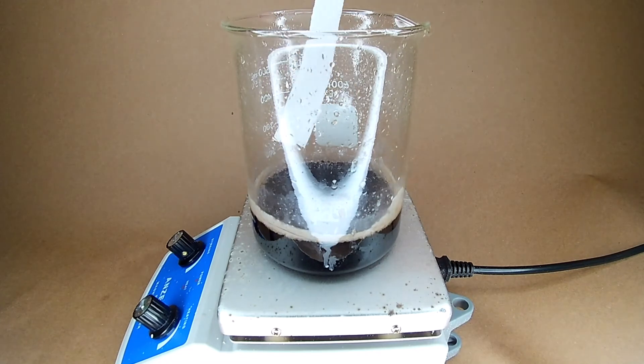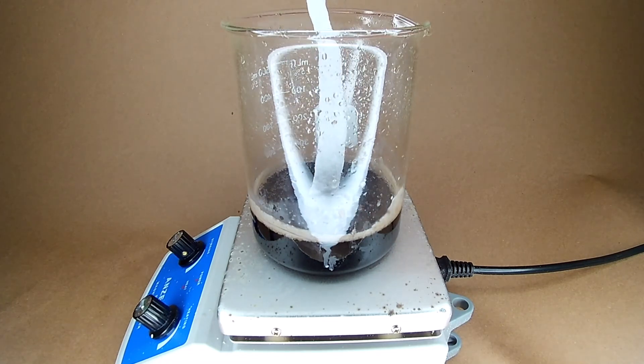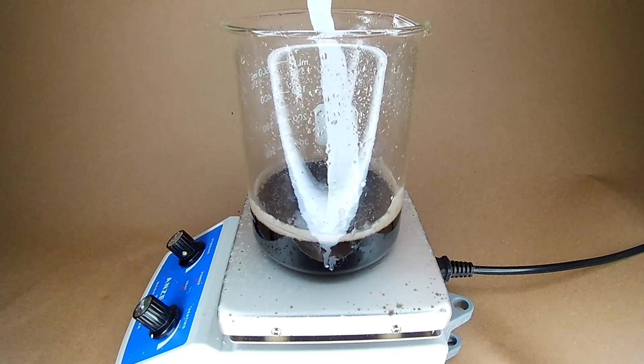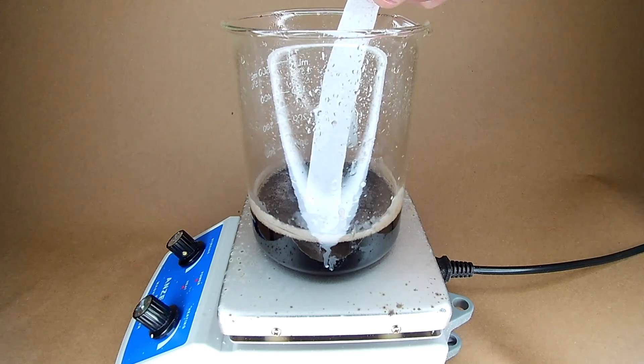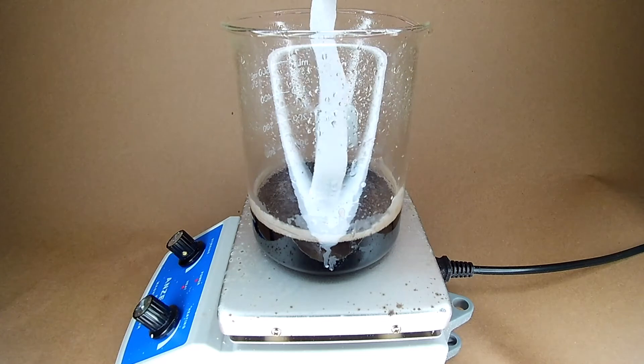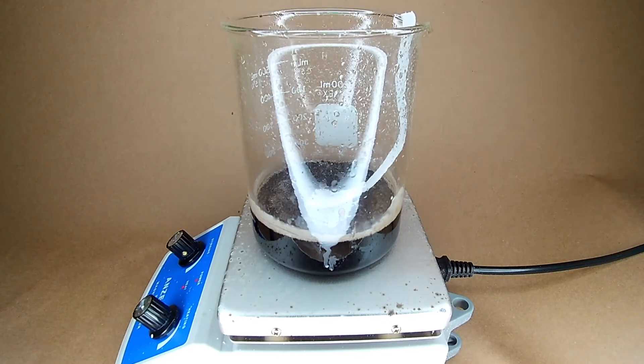Once the solution was finally dissolved again, I started feeding strips of paper towels into it. It definitely is dissolving, but only when submerged.